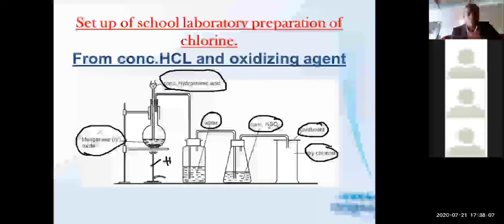This manganese oxide will oxidize the HCl, the concentrated acid. It will oxidize it to water and chlorine gas.